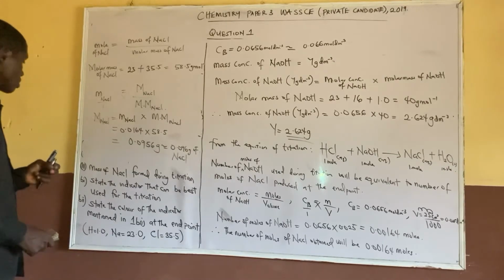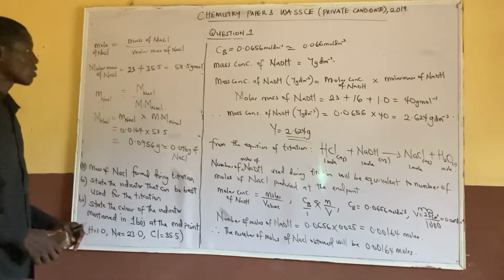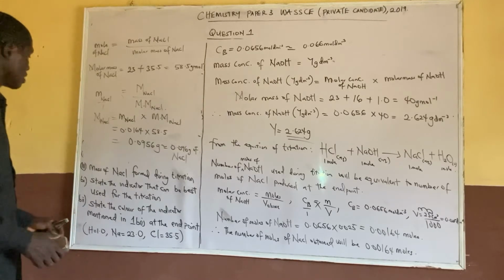The next thing is: state the indicator that can be used.